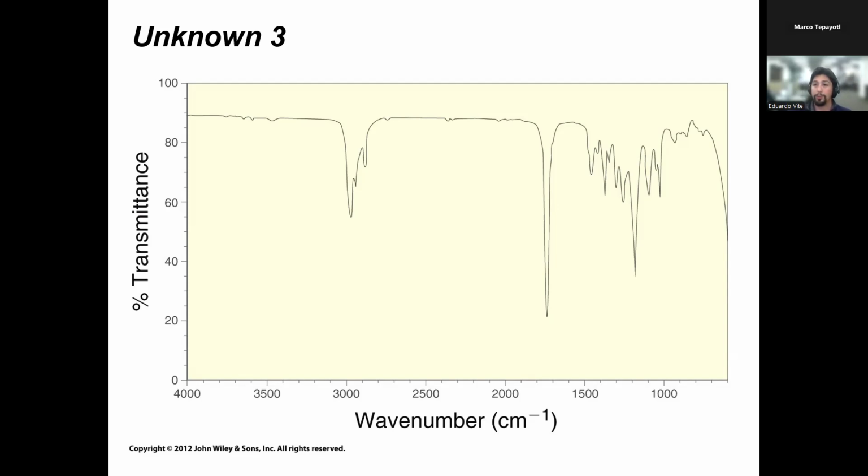Did we look at the shape? Yes, you look at the shape of the peak. If it's very strong and sharp, then that tells you one thing. If it's not as sharp but still very strong, that tells you something else. So you always look at the shapes of the peaks as well. And then Aiden said something to do with the absorption band at around 3,000. Remember, whenever you see the stalagmites, what is usually at 3,000?